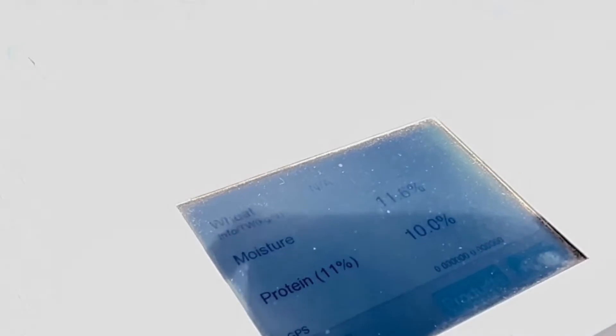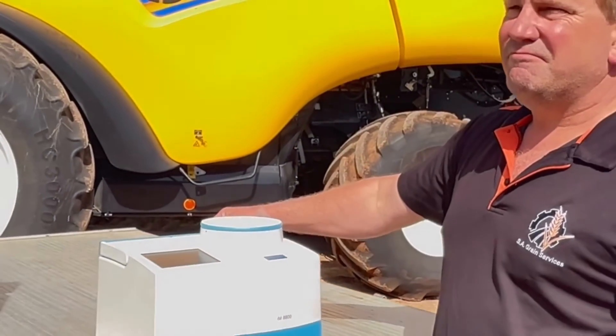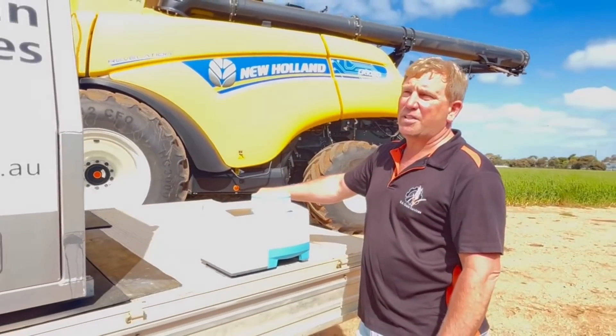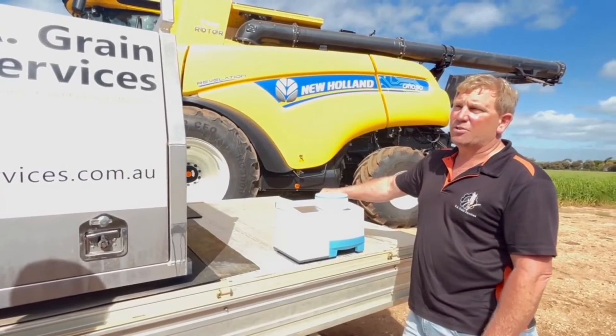At these rates you're off — it just tells you everything you need to know about whether it's ready for harvesting. You can also run canola, chickpeas, lentils, beans, peas, sorghum, and corn through this machine — there's a wide range of crops it handles.